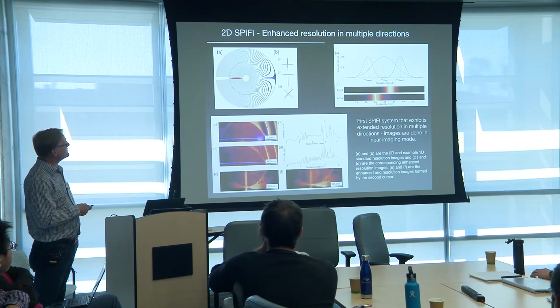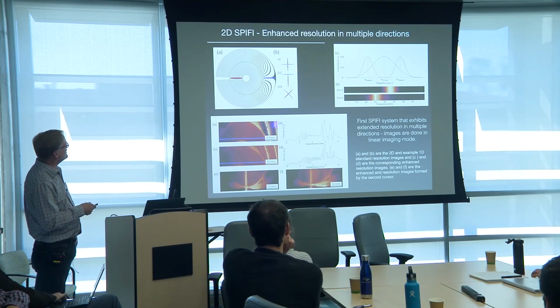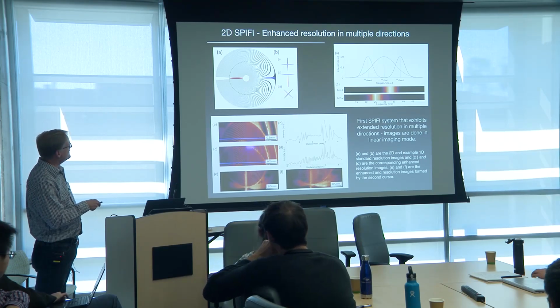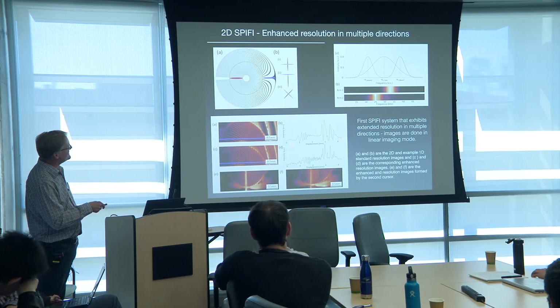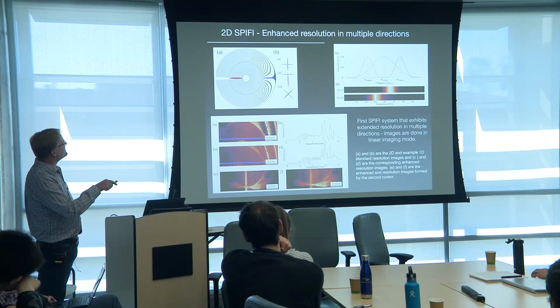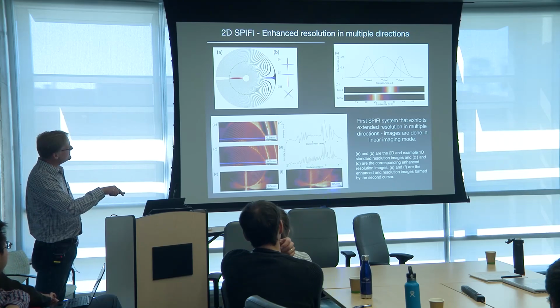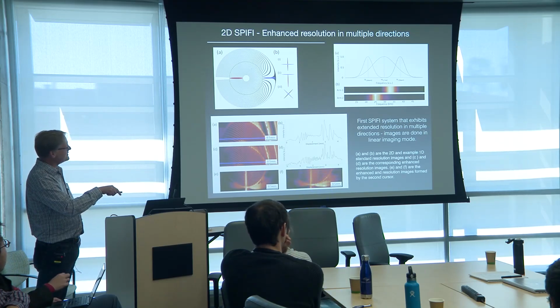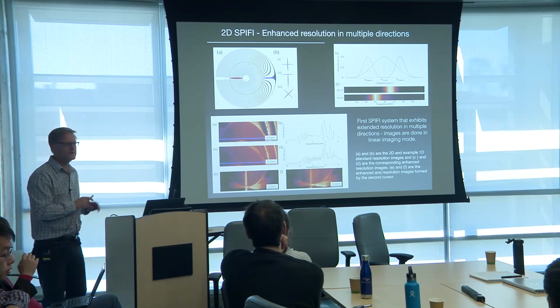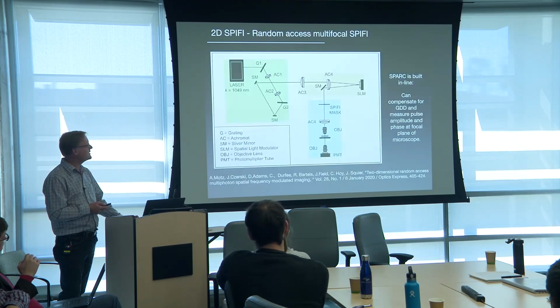And so here we are. We machine a kind of interesting structure in the glass. So this is with this line cursor, and there's our second order image. And so you can see there's the standard resolution, there's our enhanced resolution. And similarly, now this is looking with the other cursor along the other direction. In our low resolution standard image, you can actually start to see beats here. But when we go to the higher resolution image, it's really put together nicely. So again, you get all this kind of stuff for free. So that's one way to do 2D.